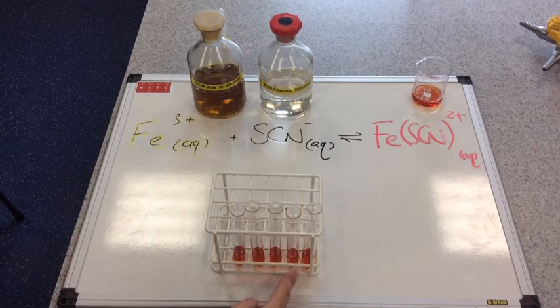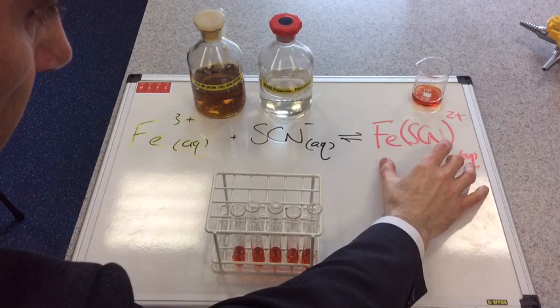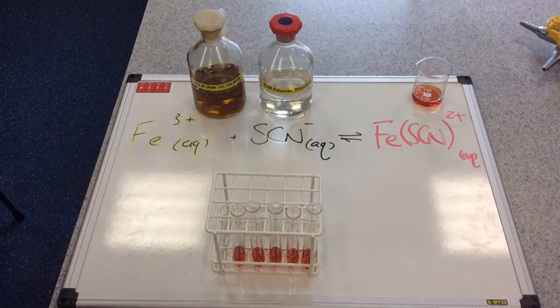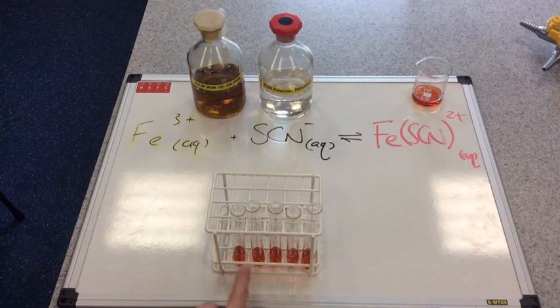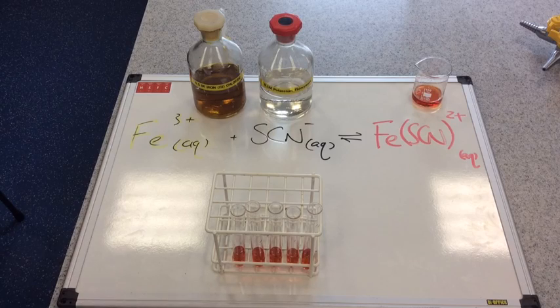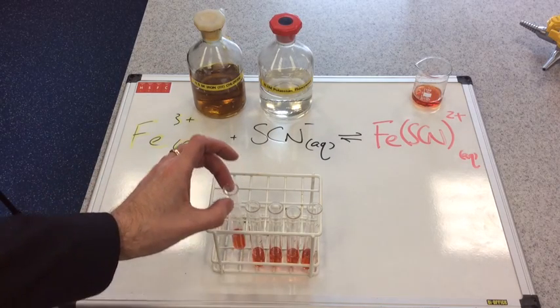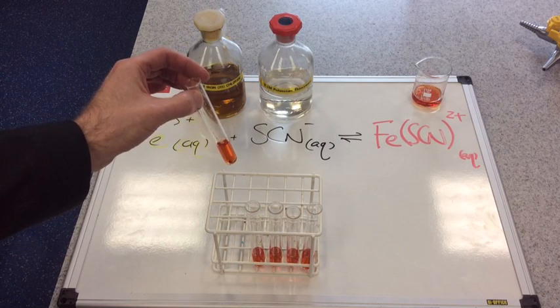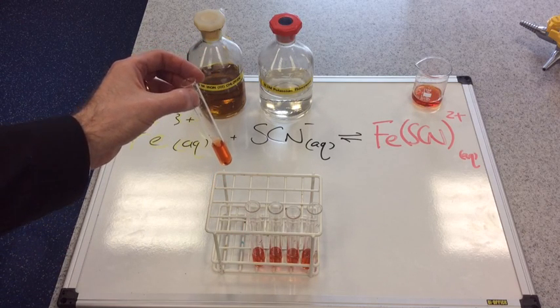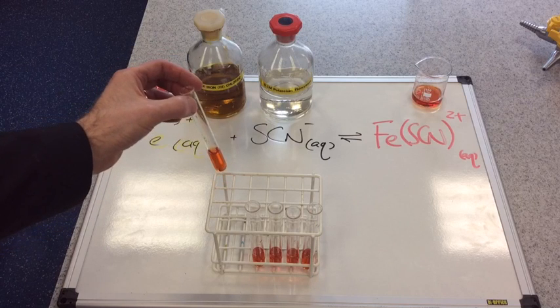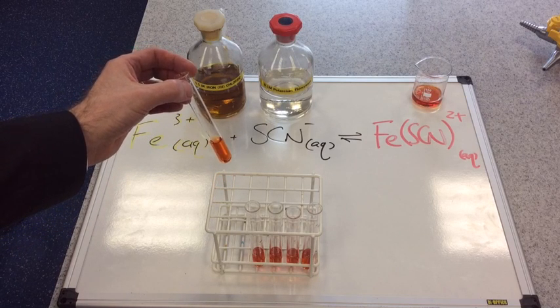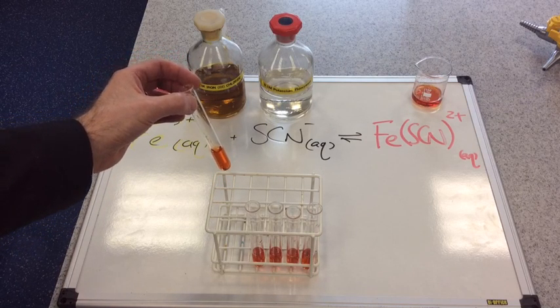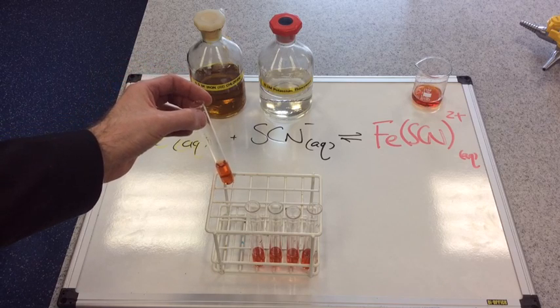I've taken some of the orangey red colored solution out and I've split it into five test tubes. I've tried to get the same amount in each test tube. I'm going to put one to one side because I'm going to use this test tube as my control. I'm not going to change anything about this one. And we're going to use this to see what has happened to the position of the equilibrium.